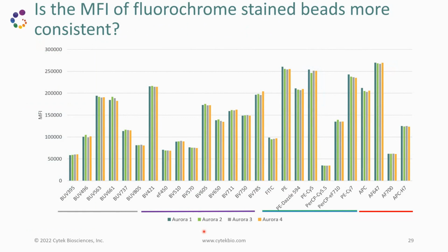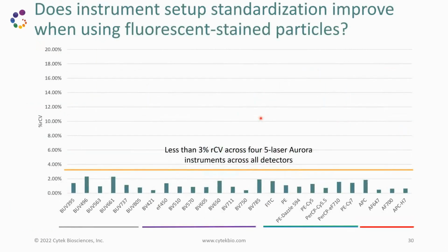So these are 4 instruments, again, dyes that are expanding through all the laser lines, all the wavelengths, and now you can see that the bars are about the same level across the 4 instruments, and you're going to be amazed. I left this access to 20%. You're going to tell me why you left that scale.